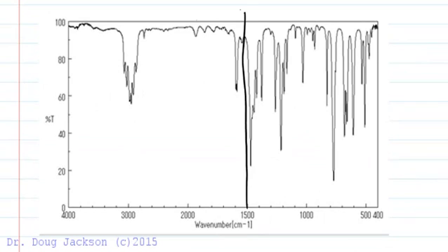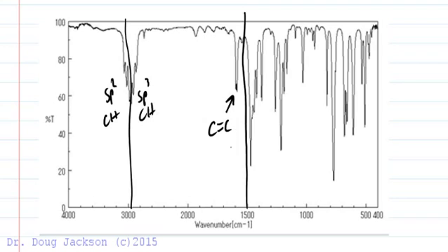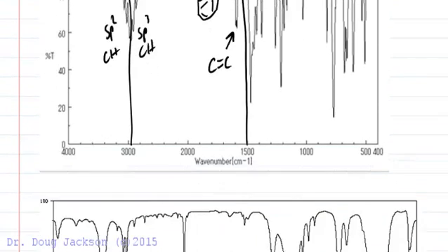Again 1500, 3000. We've got SP3 CH and we're like these might be SP2 CHs because they're left at 3000 but I can't draw a straight line so are we right? Well sure we're right. We have here a C=C double bond stretch and we also have aromatic overtones. So we've got the aromatic teeth here that also indicate that we've got some alkyl group attached to an aromatic ring. So the base of that compound is going to look like this although there could be other substituents as well. But there's some kind of substituent on an arene ring. Maybe more than one substituent.